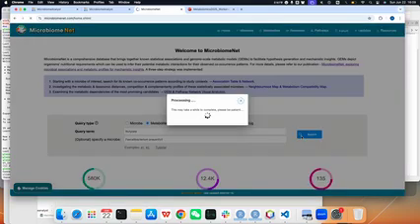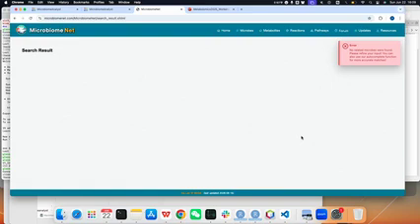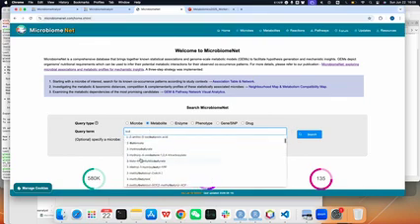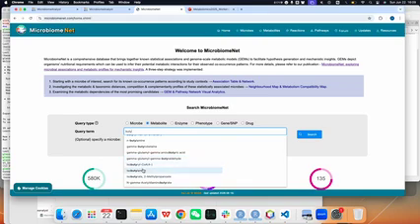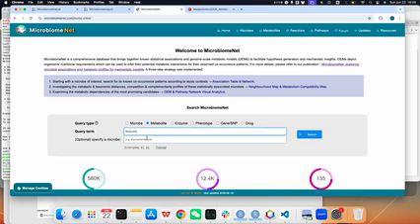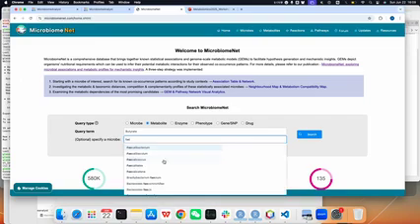So we just search. Oh, well, I might have typed something wrong. I'm sorry. But I tested a few minutes ago. It works. Is it the internet connection? I have a connection. Let me see, because I just checked. It always works. Let me see.